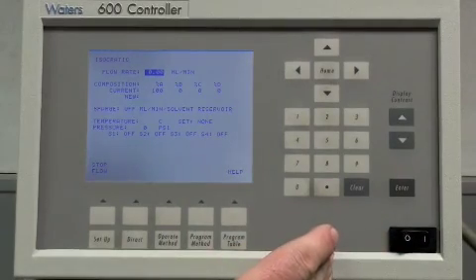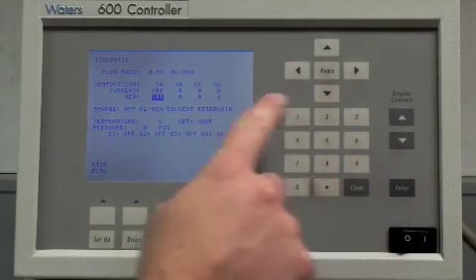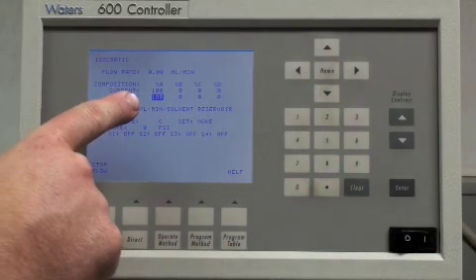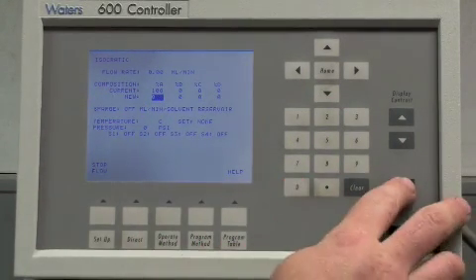So, in this case here, we'd like to use channel V. So we've got them down using the down arrow. At the moment, as you can see, it's actually on 100% in A. So we're going to make that zero by pressing zero and enter.